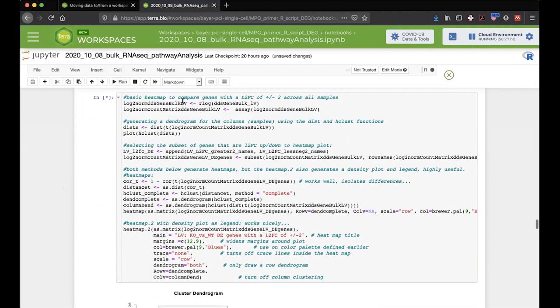This is all stuff I spent some time writing myself. I spent quite a bit of time with the hclust function, which is how we make a dendrogram, the first image that shows up here, where we're plotting hclust for the distance. You have to transpose the matrix that you work with, or it'll look really weird.